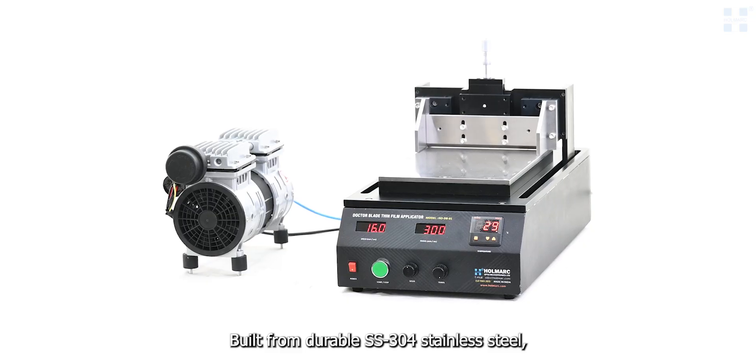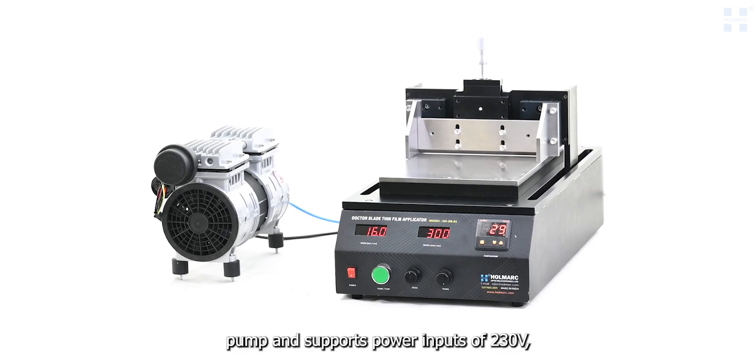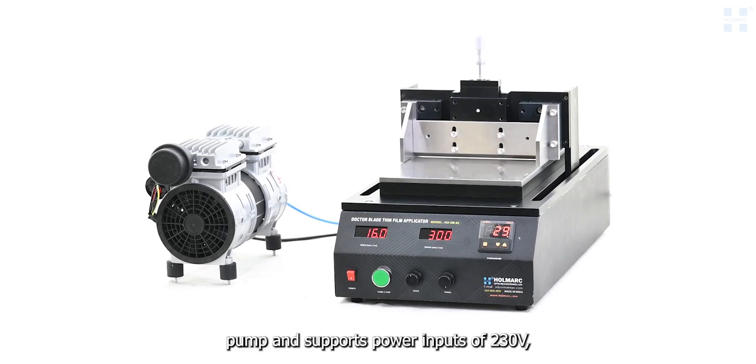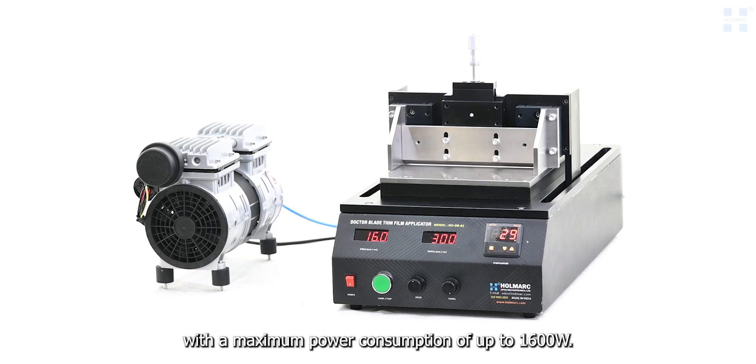Built from durable SS304 stainless steel, the applicator comes with a vacuum pump and supports power inputs of 230 volts, with a maximum power consumption of up to 1,600 watts.